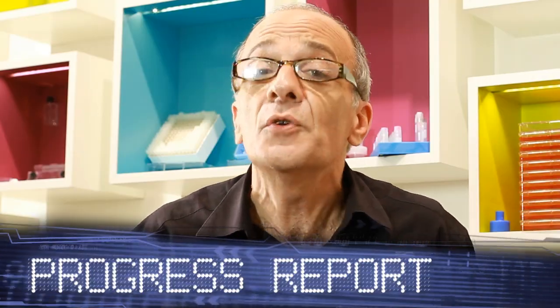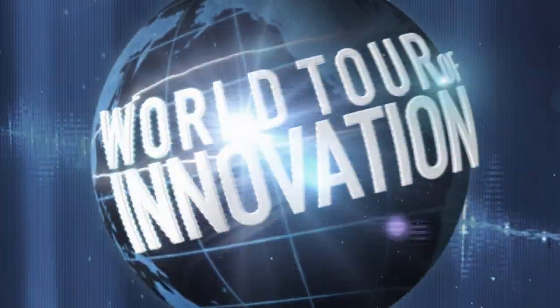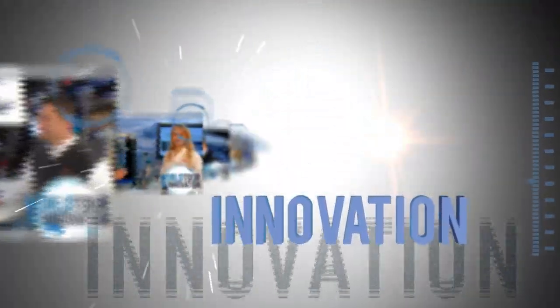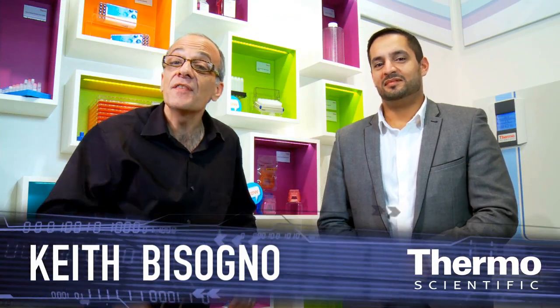We want to make your life easier in the lab. We've got a great solution for CO2 incubation. Meet Suki Uppel — he's an expert in CO2 incubation. We're here at Analytica 2012 in the Thermoscientific Technology Exhibit.